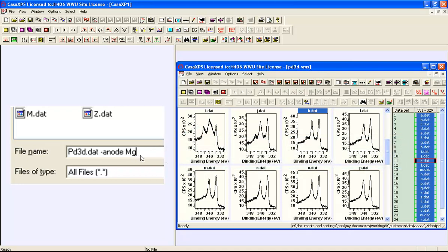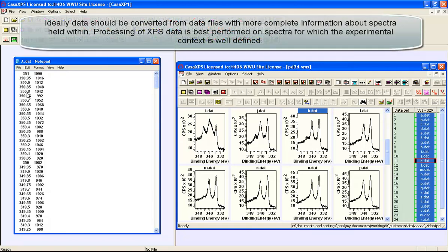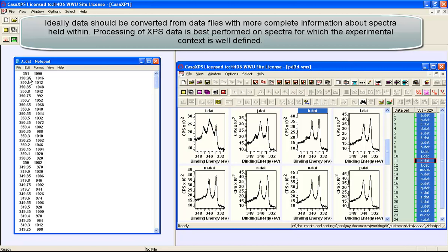When they are converted, the two columns of data that represent the binding energy and the intensity, and these are all at a uniform increment in the binding energy, are then read.